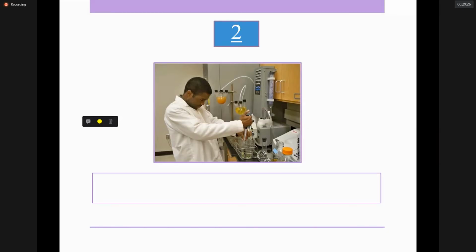Yeah, without the goggles. أيضا، هذه اللي زي الملقط حق الأنابيب، إنه يمسك الأنبوبة بيده. ممتاز. Without eye protection, without eye goggles.